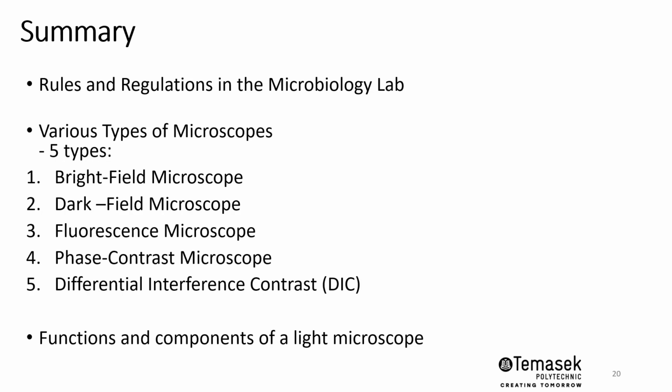All right, as well as following safety procedures. This includes the waste disposal procedures. All right, disinfecting your benches before and after work with 70% ethanol. Remember, 70% ethanol is a bactericidal agent that kills bacteria. Okay, however, it's not effective against bacterial spores. All right, biohazard material should be placed inside yellow biohazard bins, but if they are sharps, they go into the sharps bins, right? All right. Importantly, when you're working in the microbiology lab, you need to familiarize yourself with the safety equipment. These include the eye wash, for example, or the showers.